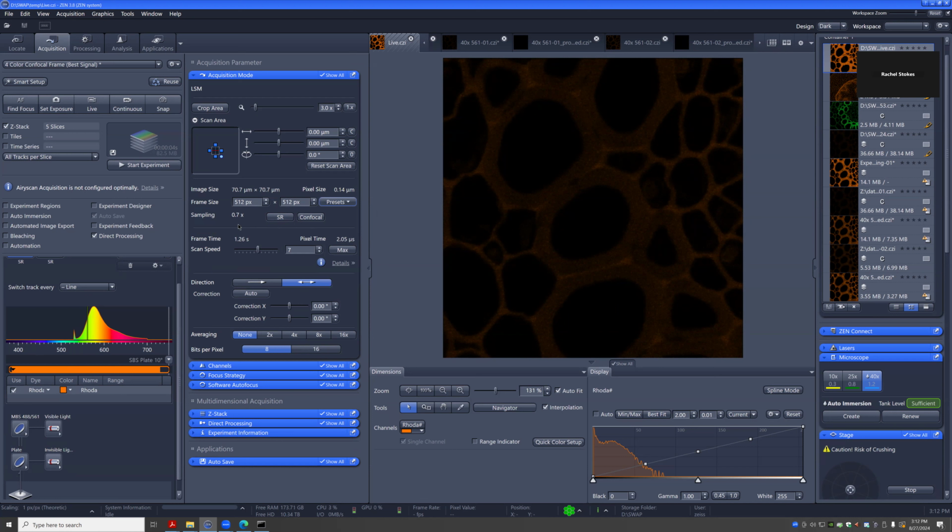And of course, if you're going to use a super resolution detector, it's kind of a waste to do 512 by 512. You might as well do confocal at that point, because you're sampling way lower than the super resolution detector can resolve, so you're not gaining much from the power of what that detector can do. So generally here, you're going to be more in that 2x sampling realm. But there are nice things you can do with that confocal sampling: you'll get more sensitivity out of this detector than you would get with the regular confocal detector. That's why this option is there.